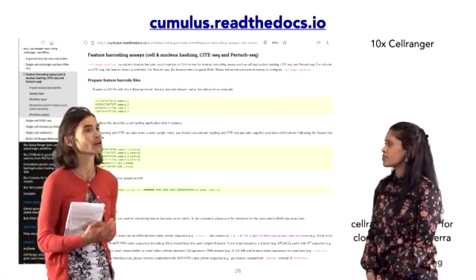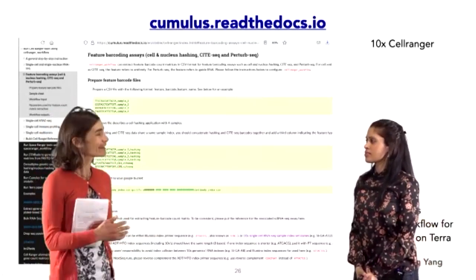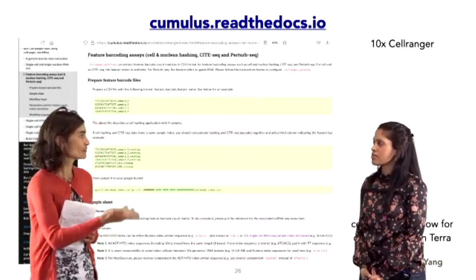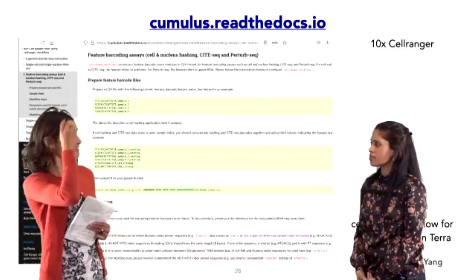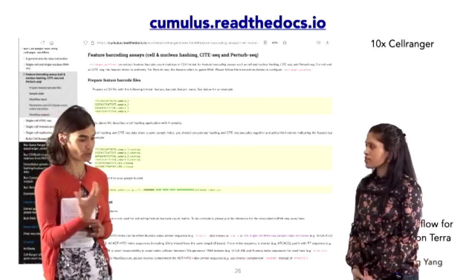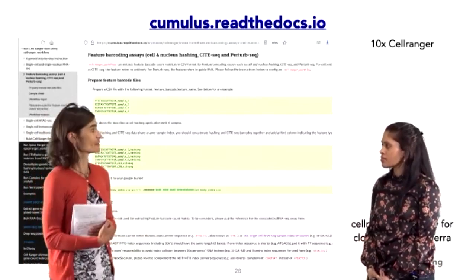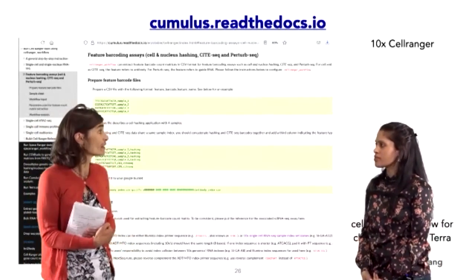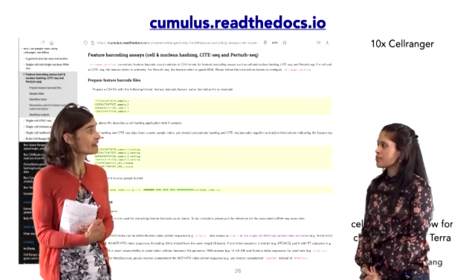And I'm curious about whether you would advise us, if this is a promising or a really bad idea, to try to apply the same sort of analytic framework that you and others have developed here to think about perturbation in the broader sense, where it's not a guide-mediated perturbation on the level of an individual part of the genome, but an environmental effector, basically. And I wonder if we could use some of the downstream analysis that you've developed to ask about how the environment matters and what its specific effects are.